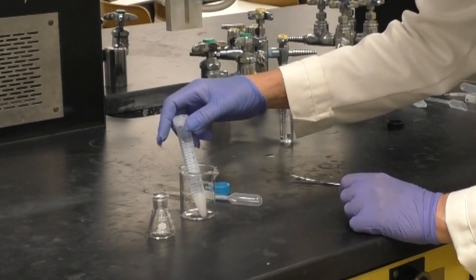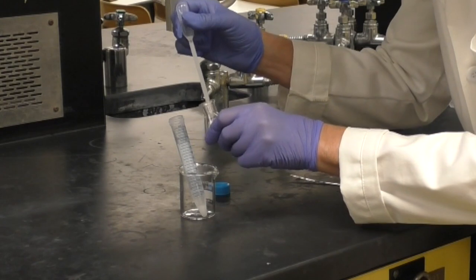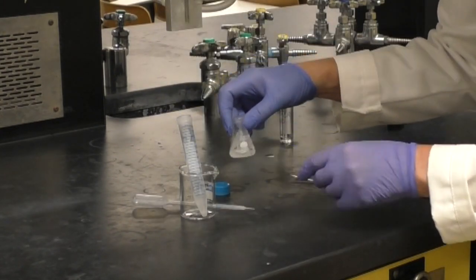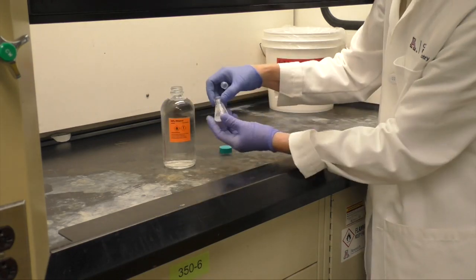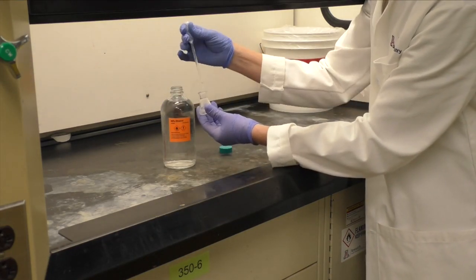Once the mixture is separated, transfer the organic layer, again that will be the bottom layer, to a 10 milliliter Erlenmeyer flask. Add 2 to 3 milliliters of 95% ethanol to the flask.